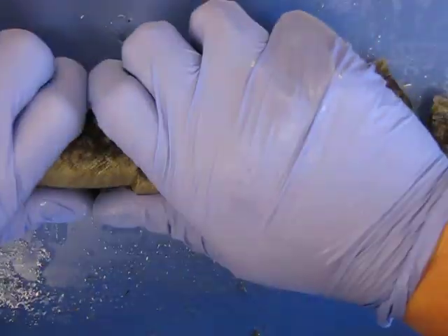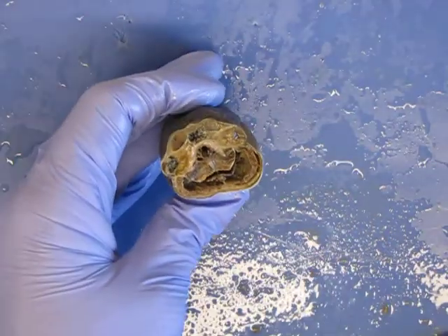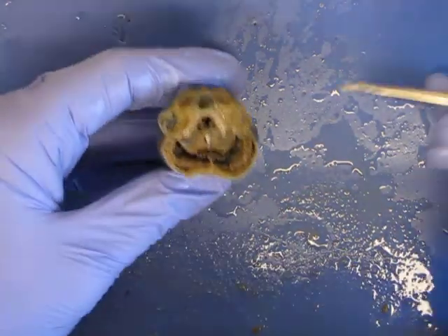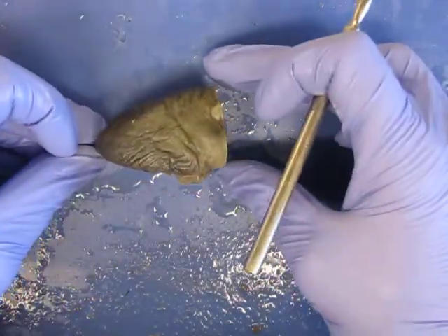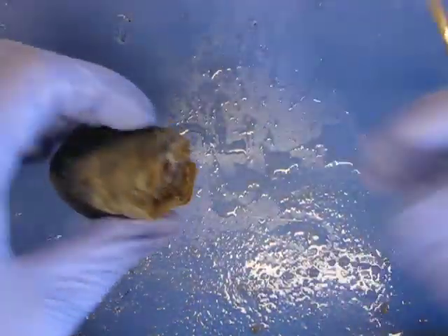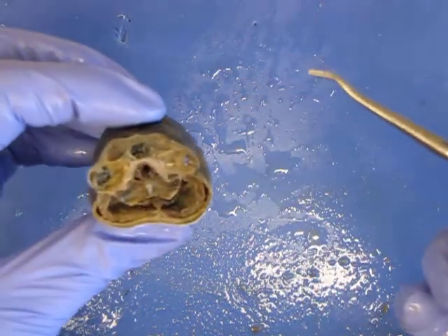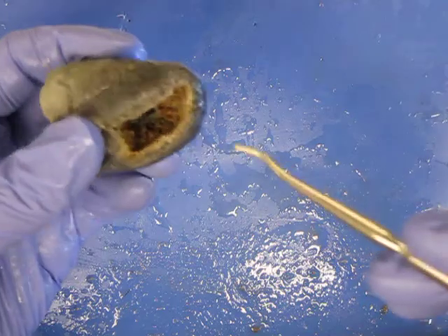Okay, most of the structures you'll be identifying on sagittal section, but there are some things on cross section that are interesting to look at too. So the first section here will also have the buccal funnel, so that'll be the easy part. It's also a good idea to try to take this apart and put it back together like a puzzle. It really helps you learn what the actual structures are when you have to figure it out that way.